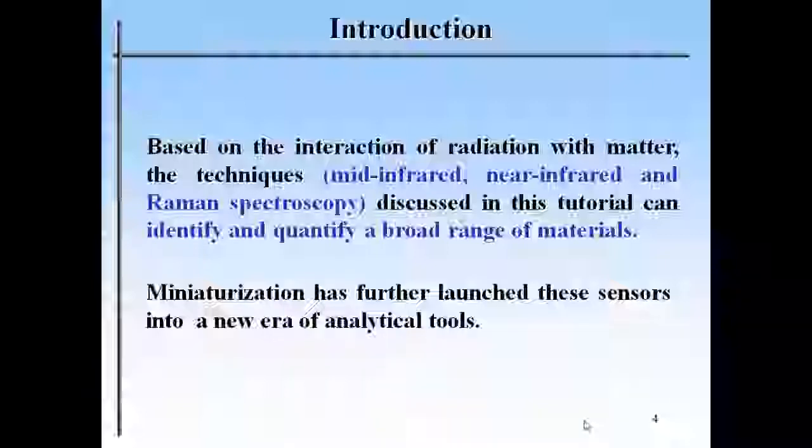Because these techniques are relatively old, some of them date back many decades, but miniaturization has further launched these sensors, let me call them sensors, into a new era of analytical tools.